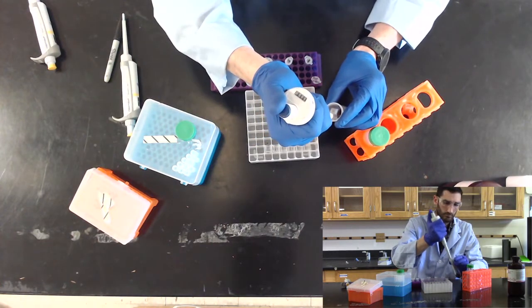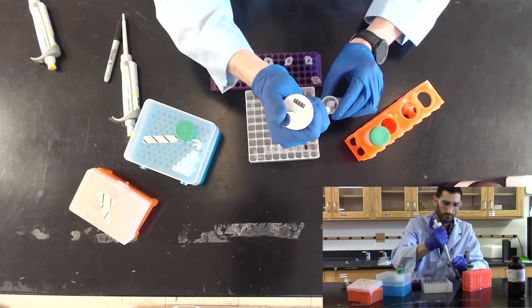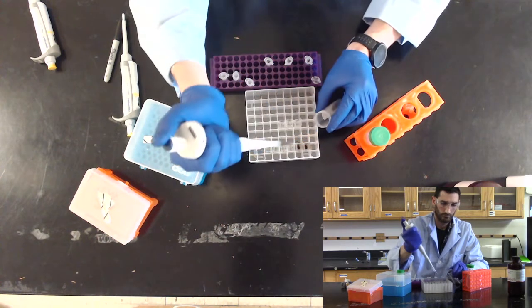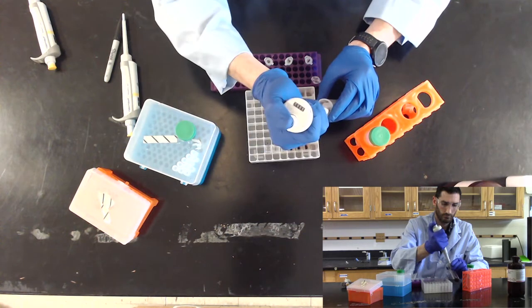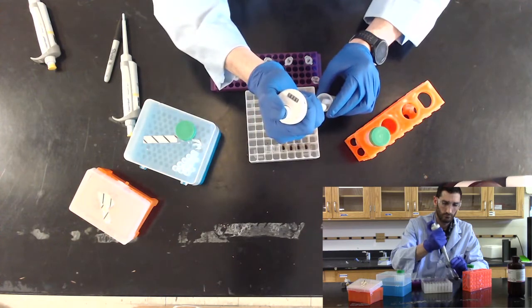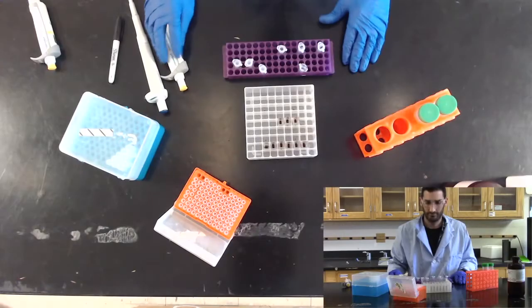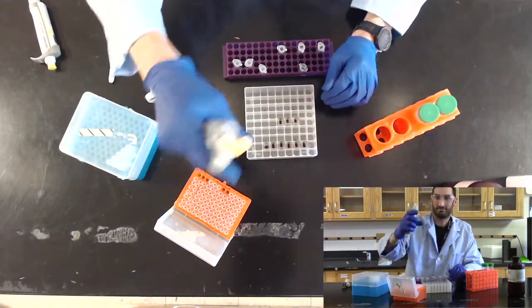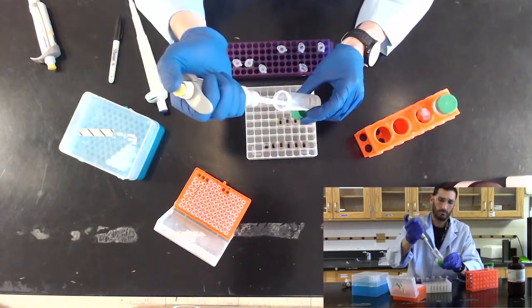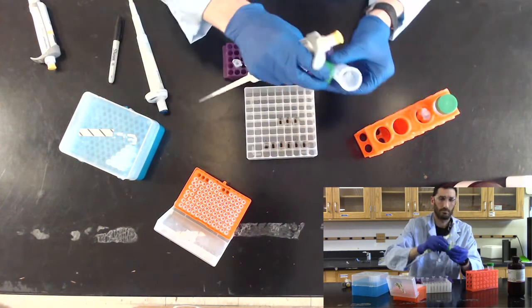Next, add 1 milliliter or 1,000 microliters of the Bradford reagent to each cuvette. Begin to add your protein standards, starting with your buffer. Your buffer will serve as your 0 milligrams per mL concentration of BSA. Add that to vial 1 or cuvette 1.